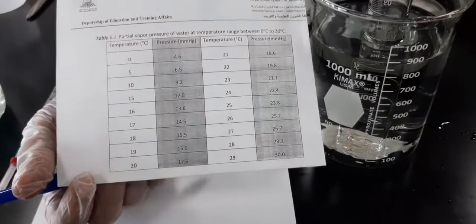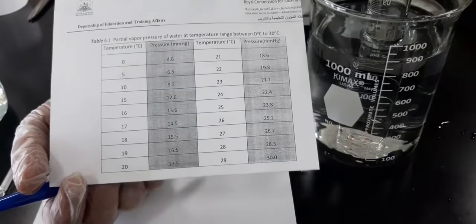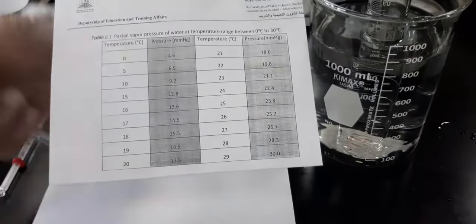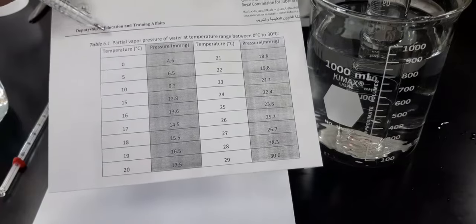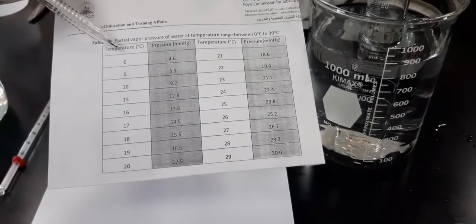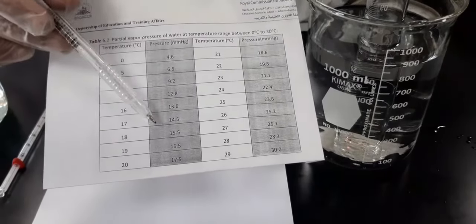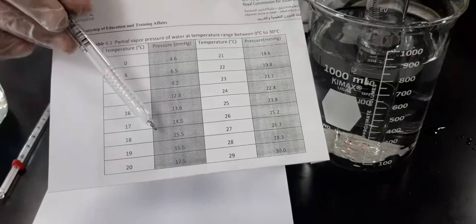To know the pressure of water, which is on the first line in the column here, you need to see the table, right at your desk. This table will be provided at your location where you are supposed to do the experiment. And you see, this is the pressure of water at different temperatures. These are the different temperatures, and the corresponding pressure of water is written in the next column.